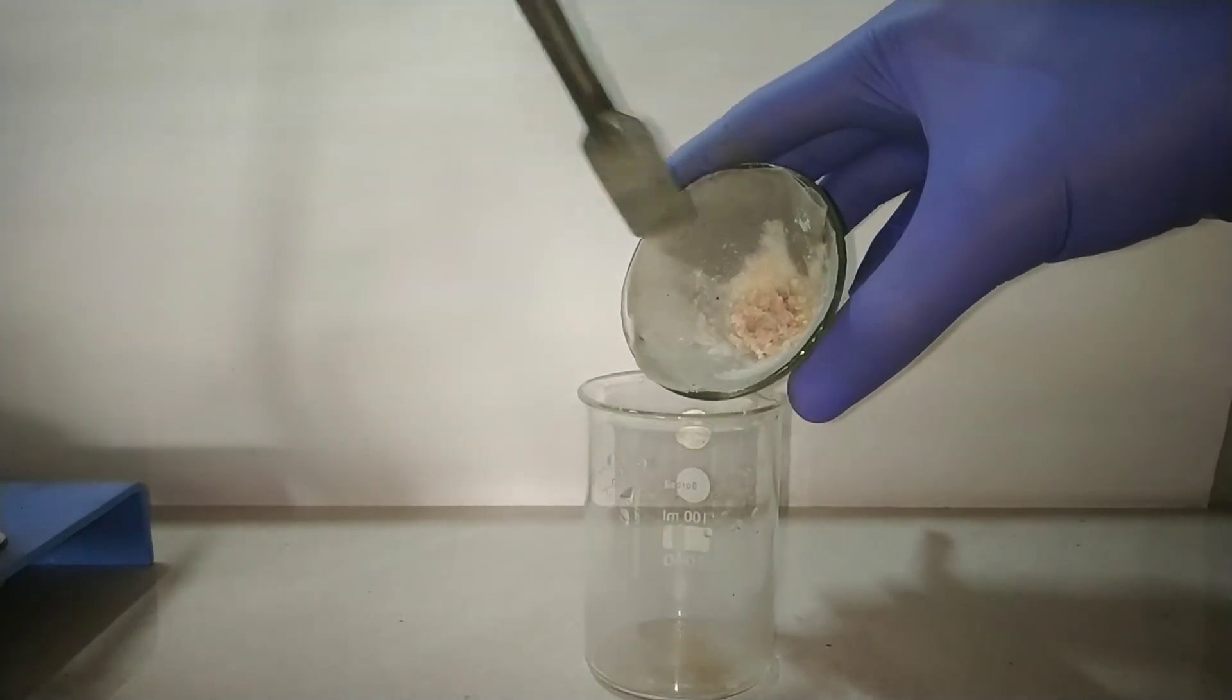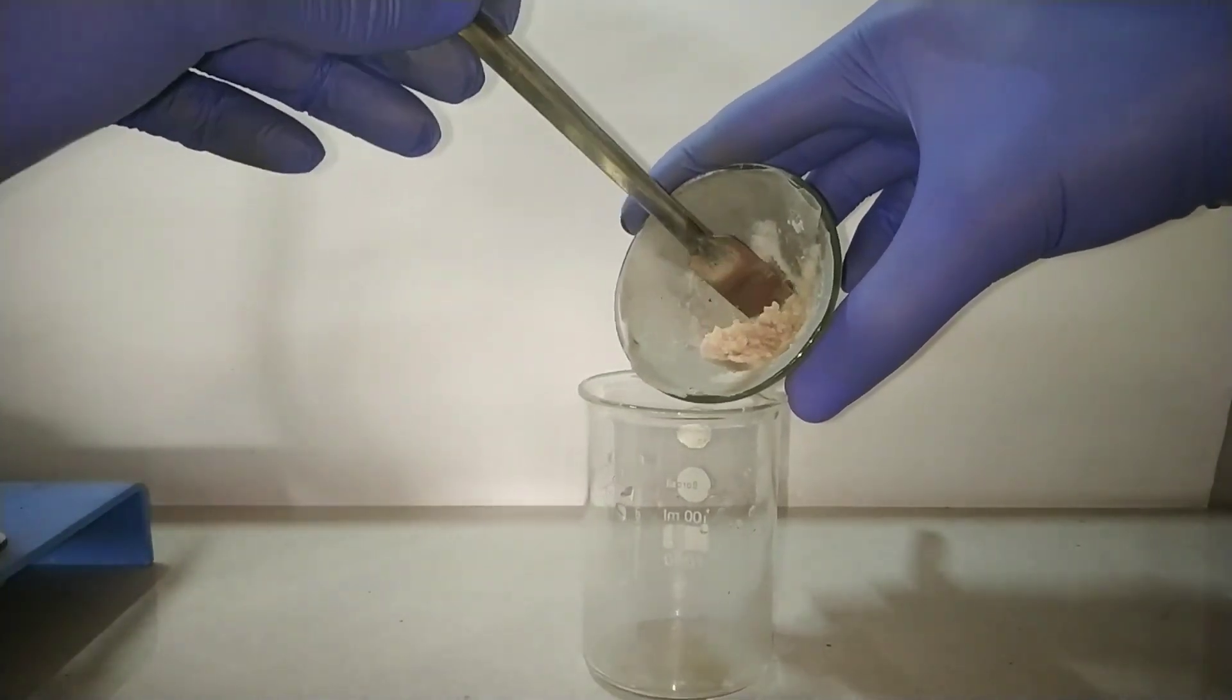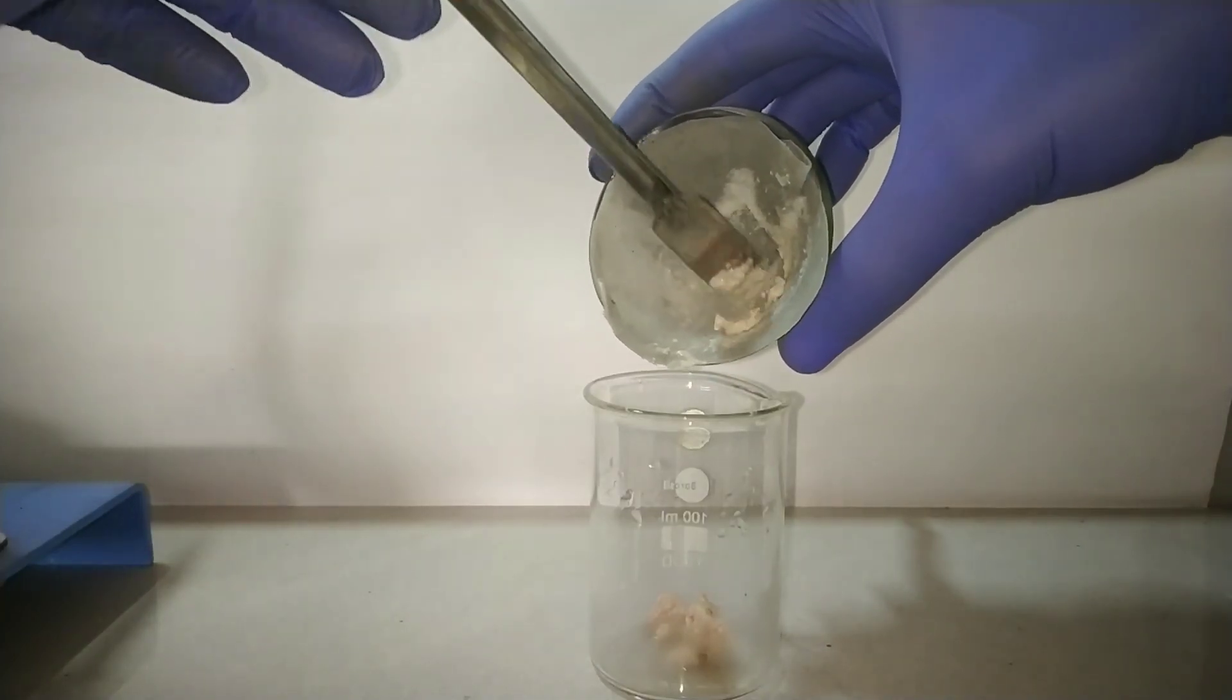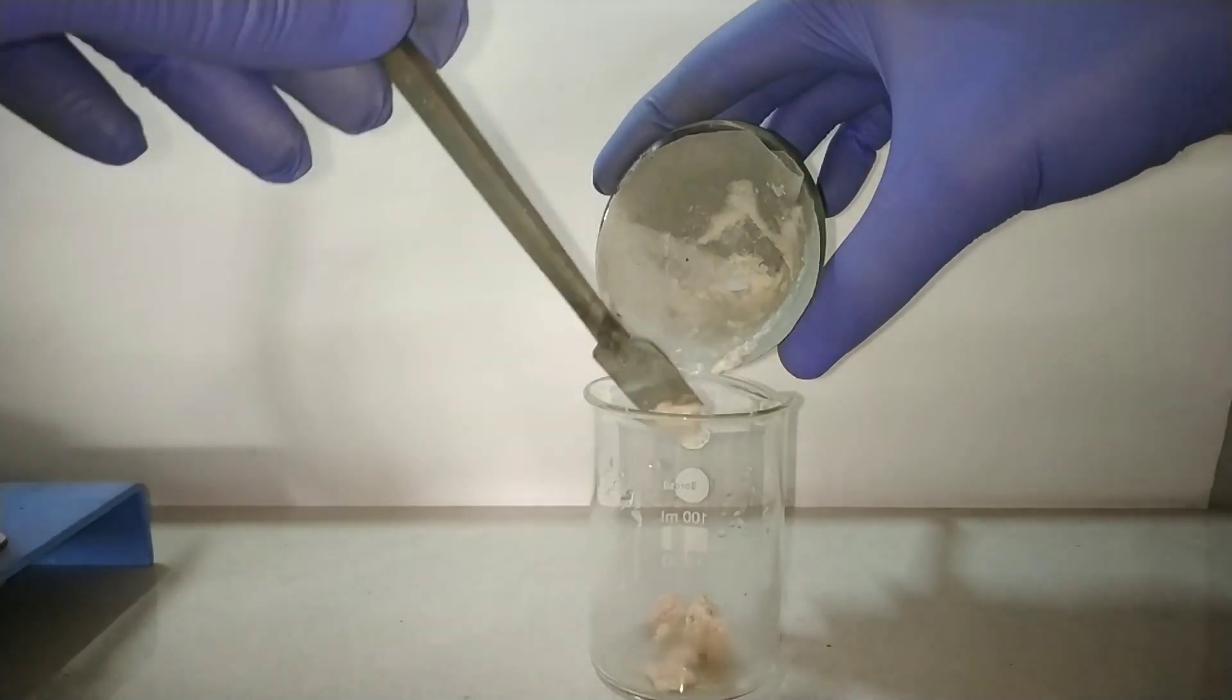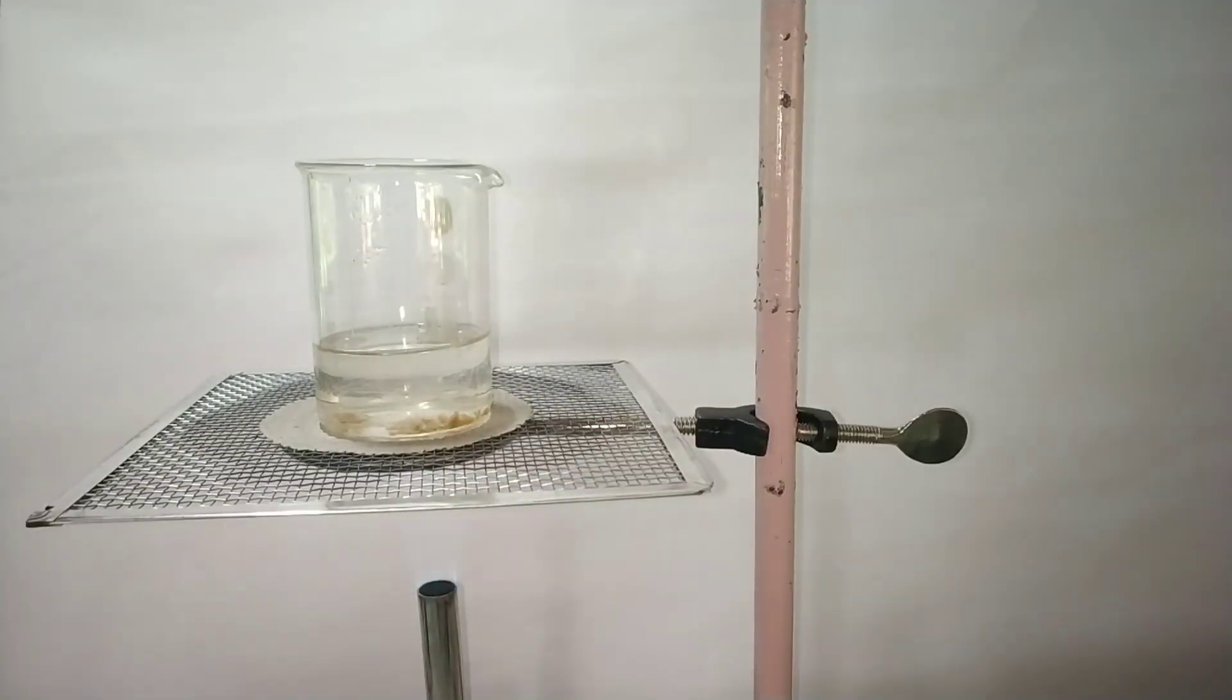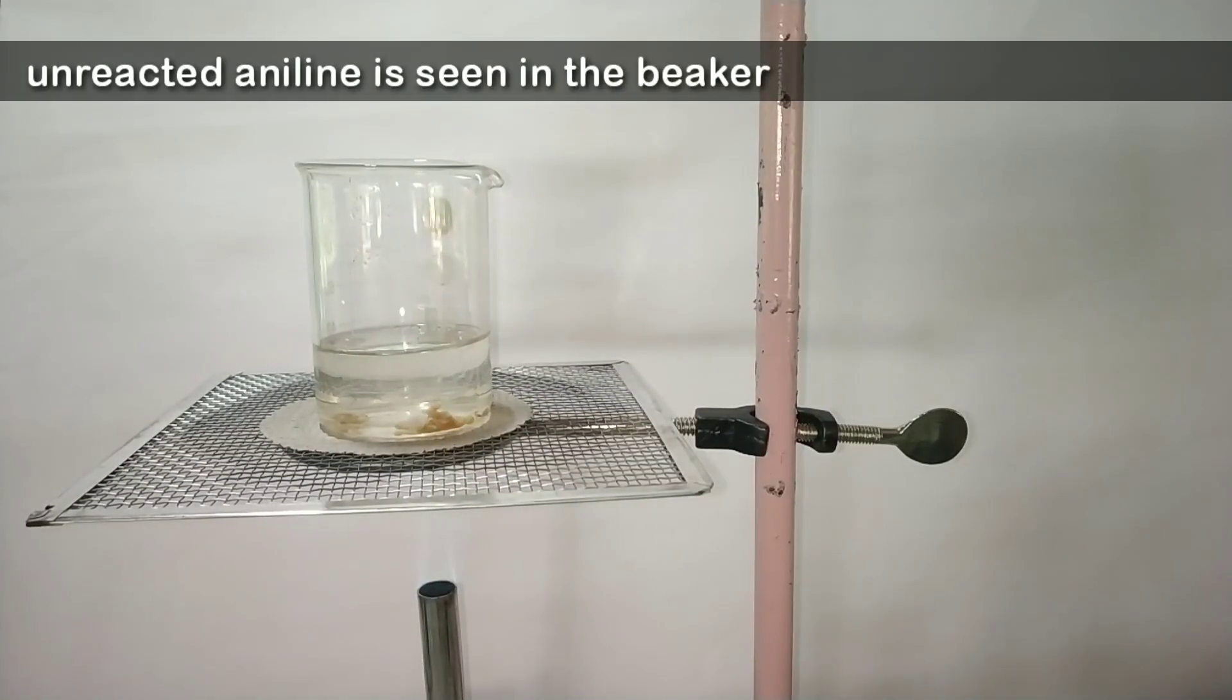I will take it into this 100 ml beaker and then I will be adding distilled water into it and I will heat the solution to boil. On boiling, most of the acetanilide crystals have dissolved.